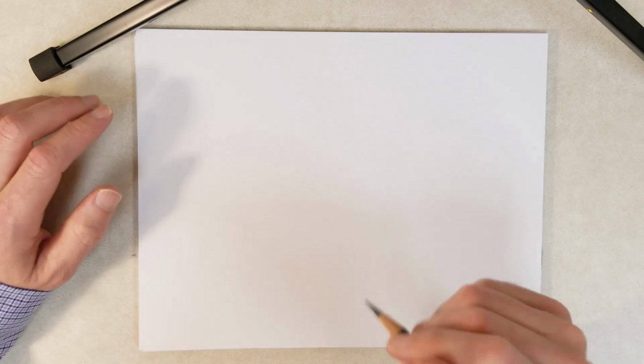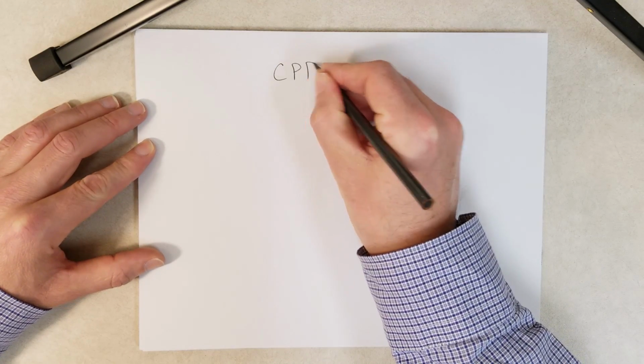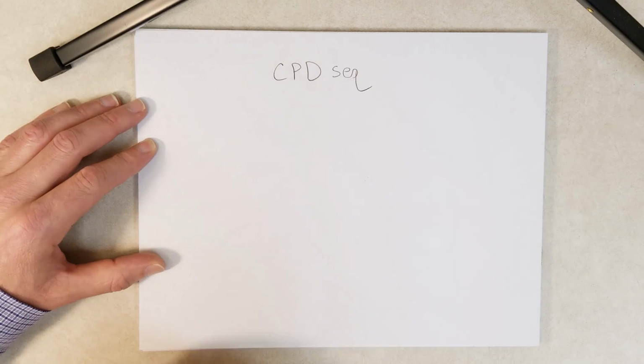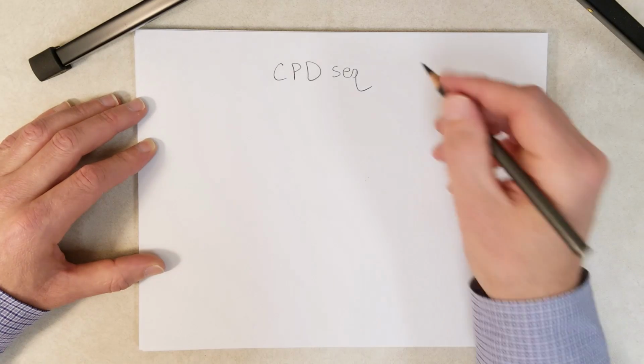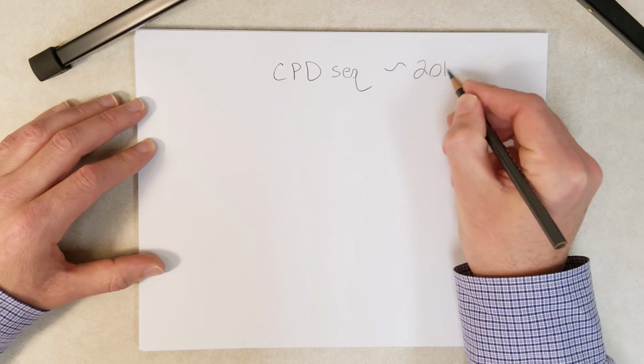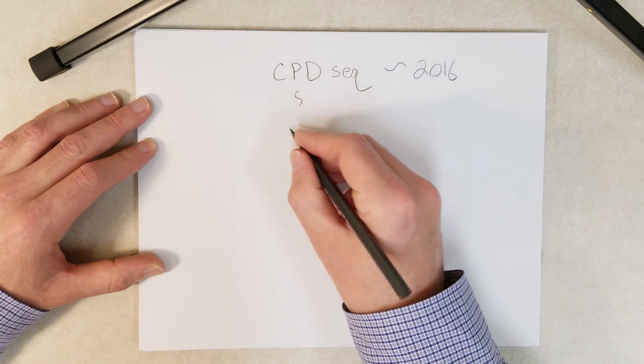Hey everybody, in this video I am going to talk about a relatively new technique for molecular biology. Now this is called CPD-seq, for CPD sequencing, and it was invented by researchers in 2016, so not too long ago.